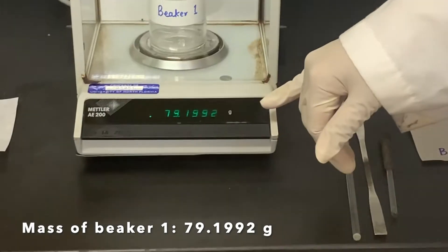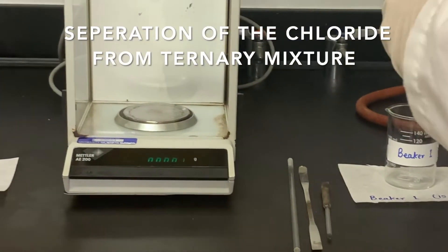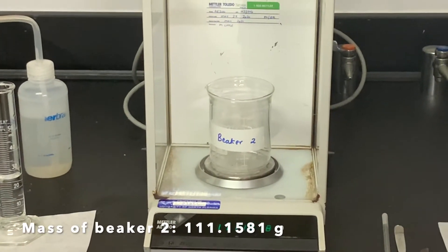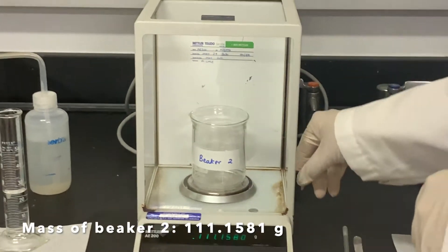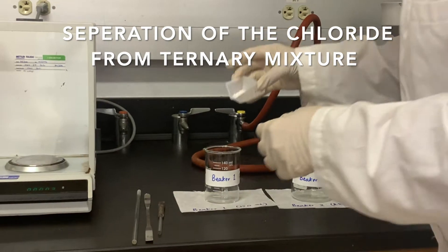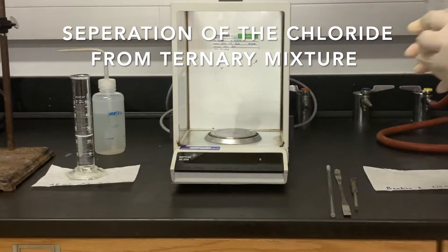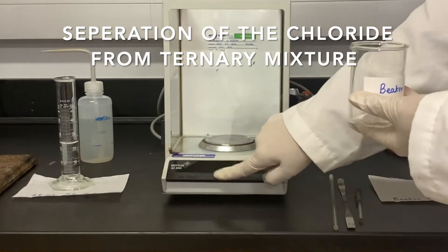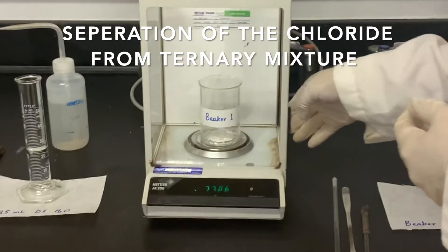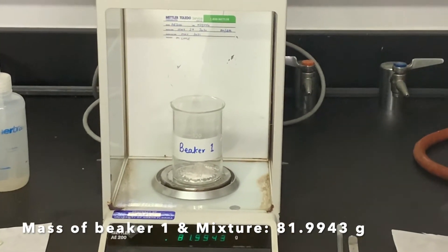The weight of empty beaker number 1 is 79.1992 grams. We have to record this. Now I'm going to weigh beaker number 2. The weight of beaker number 2 is 111.1581 grams. Now I'm going to add this mixture into beaker number 1 and then weigh again. The weight of beaker number 1 with the mixture is 81.9943 grams.